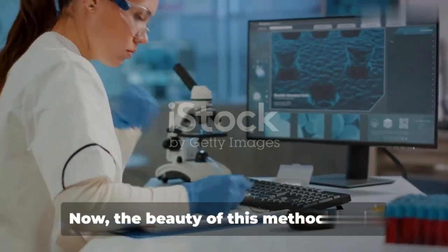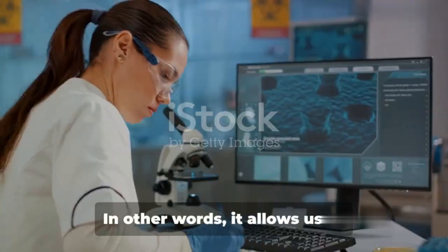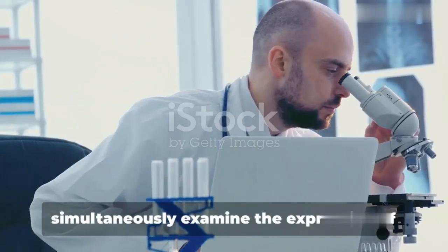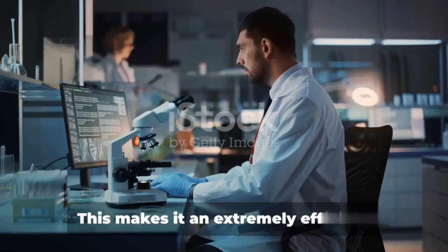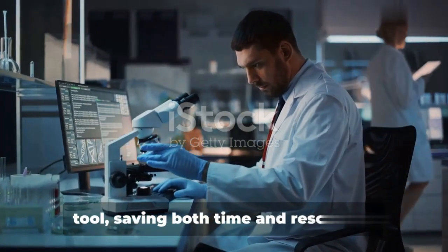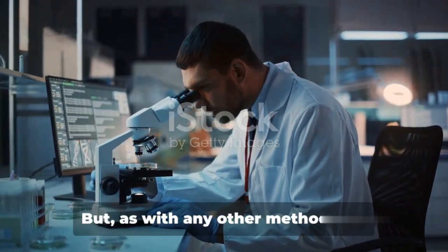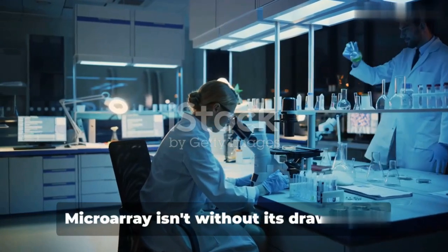Now, the beauty of this method lies in its ability to perform high-throughput analysis. In other words, it allows us to simultaneously examine the expression of thousands, if not tens of thousands of genes. This makes it an extremely efficient tool, saving both time and resources, which are often scarce in the realm of scientific research. But as with any other method, the microarray isn't without its drawbacks.